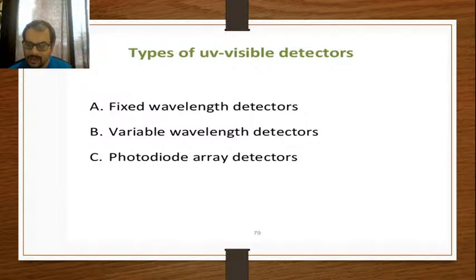These photodiode detectors consist of how many photodiodes? The number of photodiodes?